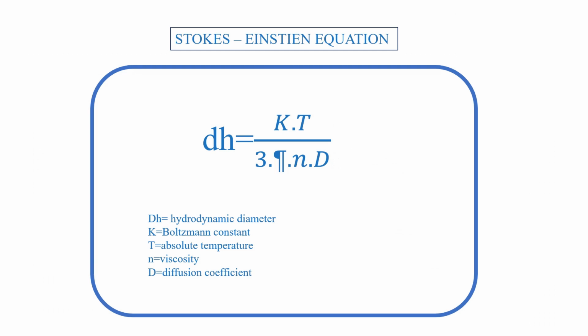Now, the correlation function which we have created enables us to extract the translational diffusion coefficient. These values are used in the Stokes-Einstein equation to obtain our size information. Variables such as solvent viscosity and temperature need to be known.